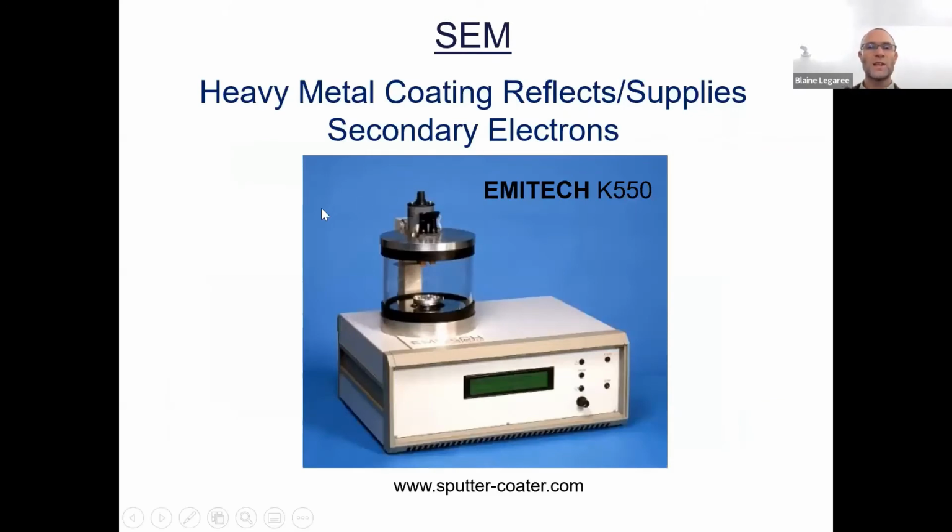Okay, so let's talk about the technique. I mentioned we add gold to the specimen. This is how the gold is added, this little thing called a sputter coater. I don't actually know how it works. You basically put your specimen in there, you press the on button, you come back a minute later and it's done. But I'll show you basically how this works step by step.